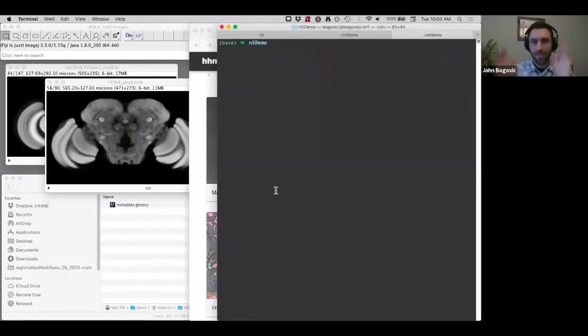Right, thank you, Mark. I'll share my screen. So today I'm going to be giving a live demo of some of the tools for working with N5 images, N5 and HDF5 and Zarr in Fiji. So it'll be fairly dry in the sense that you'll be watching me write images to files and then open them over and over again and in a bunch of different ways.